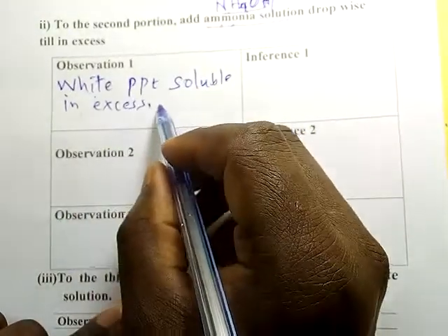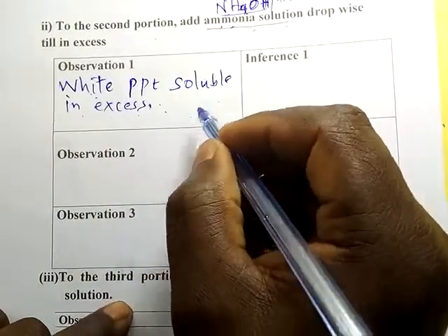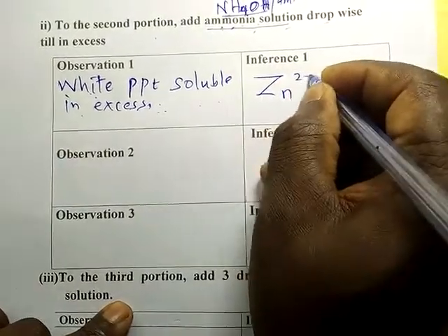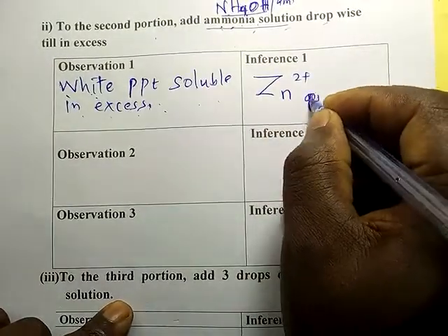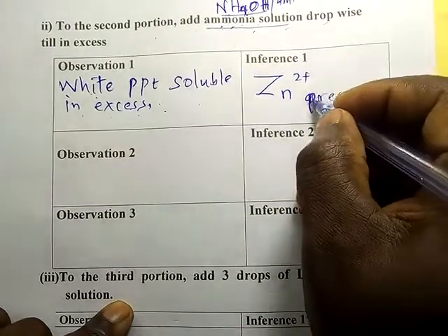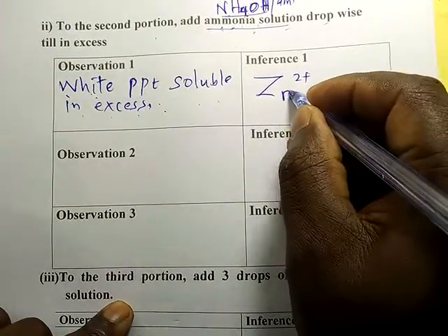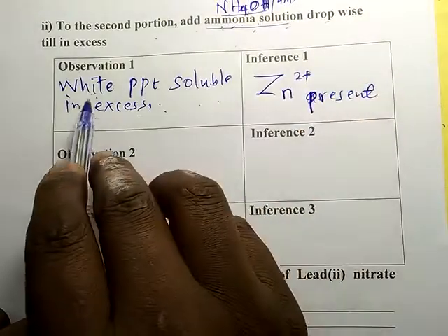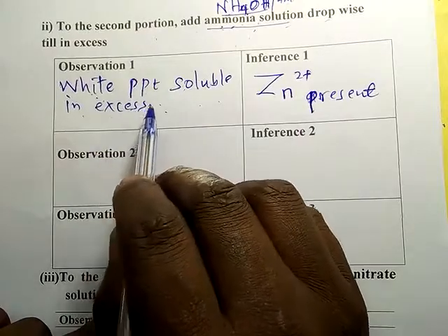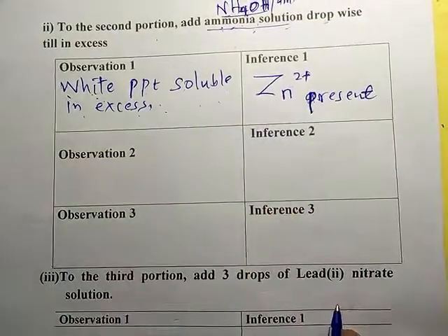So if that is the case, then it confirms that the zinc 2+ ions are present. Because this is the confirmation for zinc ions.